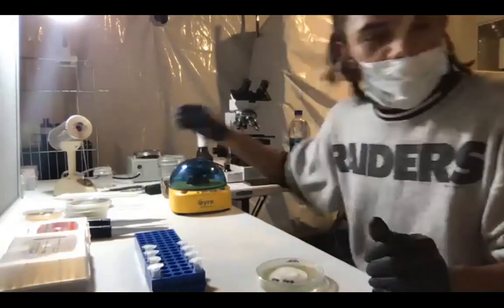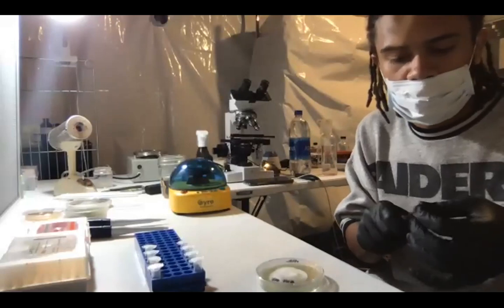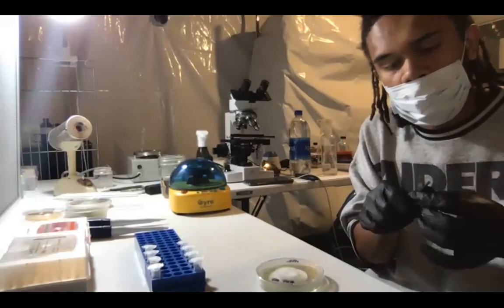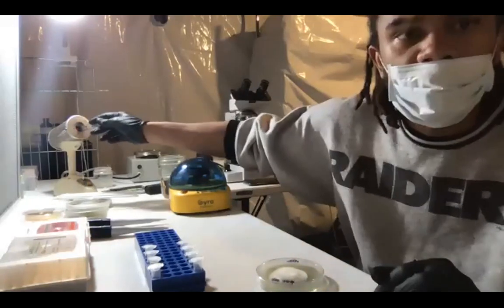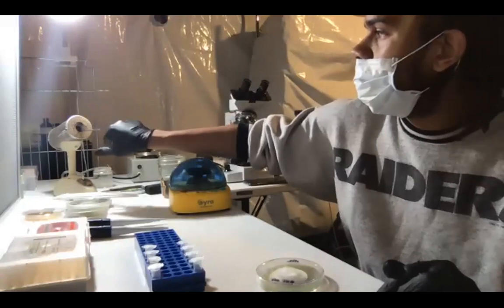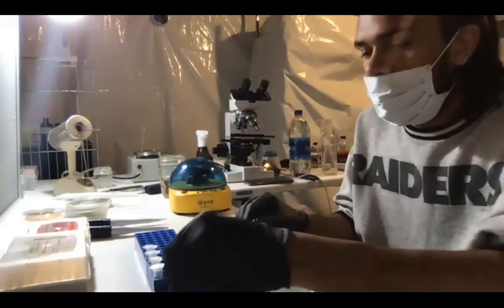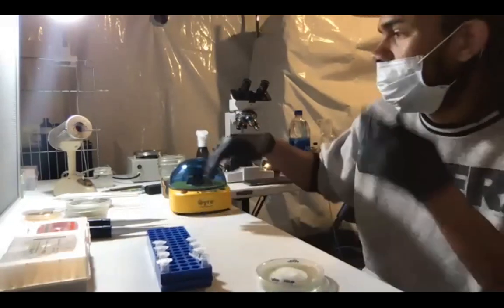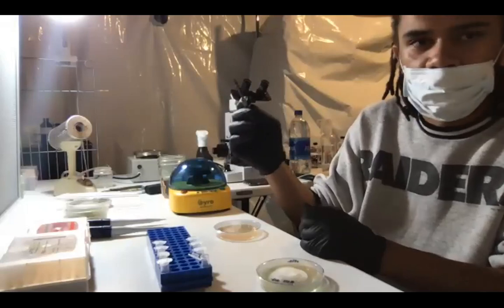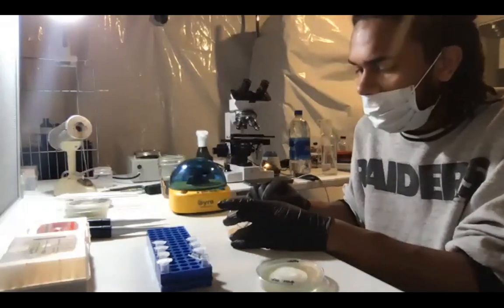All right, I have a scalpel here, and the blade is a little bit dull, so I'm going to take this blade off and put a new one on. And I'm going to sterilize this in the bead sterilizer over here. This sterilizer is high heat, and it's just going to kill off any bacteria or anything like that on there. I'm going to go ahead and open my first centrifuge tube here. And this doesn't need to be in there that long at all. You'll start melting the blade. And I'm going to go ahead and cool this down in my clean petri dish.